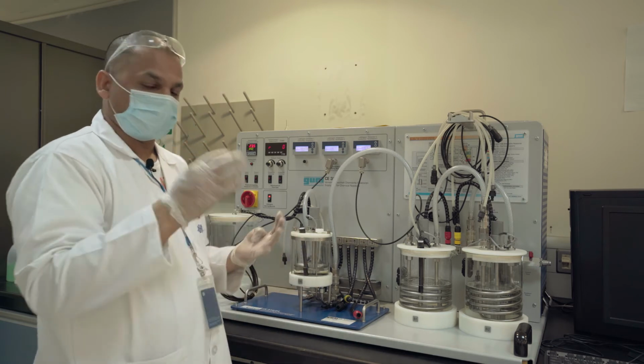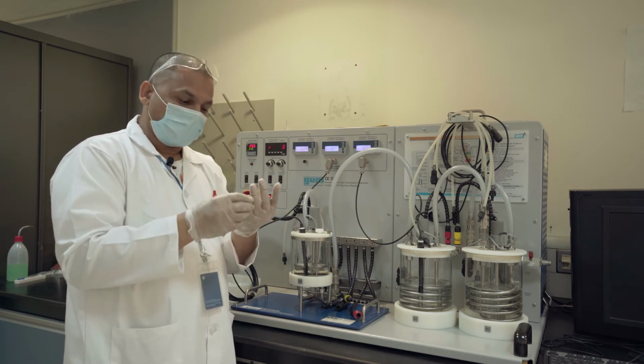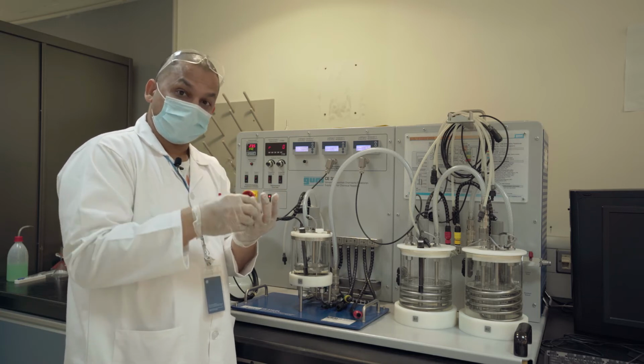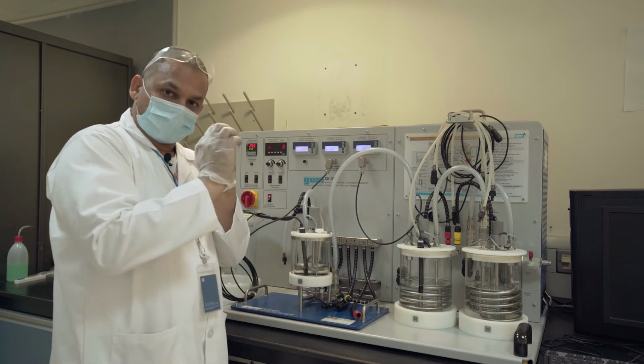To find out the four variables, how many experiments will I need at minimum? One equimolar at room temperature, and one with excess at room temperature, maybe two with excess. So one I do at 0.1, which is equimolar, then I do 0.1 and 0.05, and then one more I do 0.1 and 0.01. So that's three, so that it's more accurate. That will give me alpha and beta.